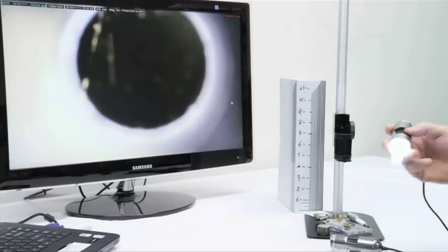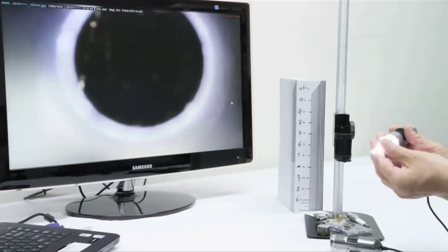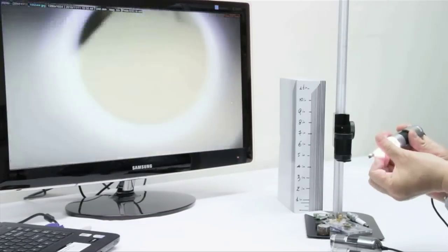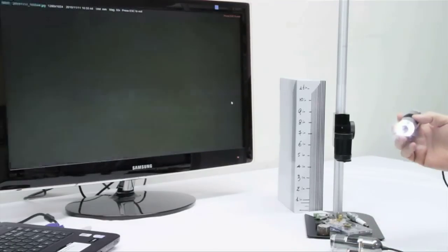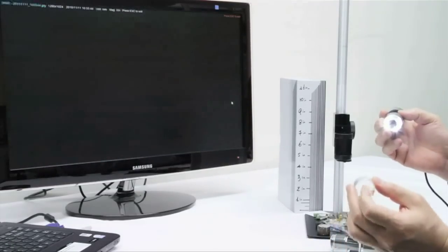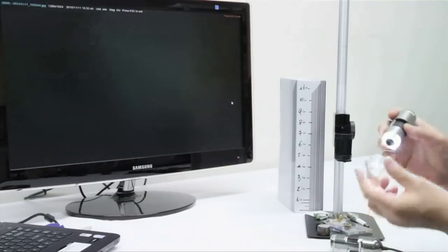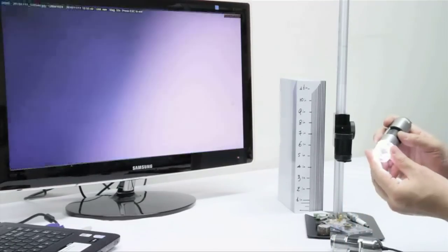Changing the caps is a breeze with this. You just line up the indication markers and then either press in or pull out of the microscope.